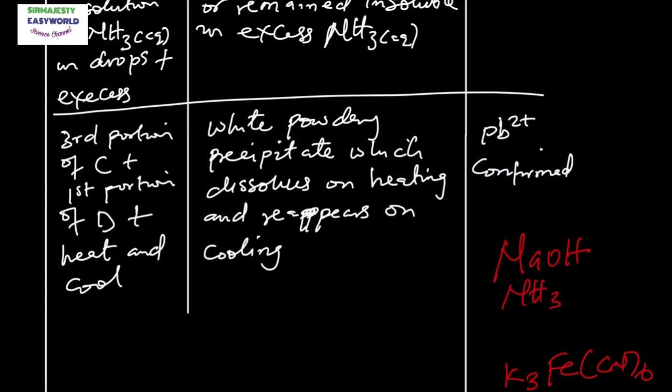Just know sodium hydroxide and aqueous ammonia are used to confirm the presence of iron-3 ion, but the most reliable is using potassium thiocyanate, KSCN, or you can equally use potassium hexacyanoferrate-2, that's K4Fe(CN)6, but they said ferrate-3 in the specimen they provided, so we work with ferrate-3. I've done the experiment on both cases. I'll give you the reports.